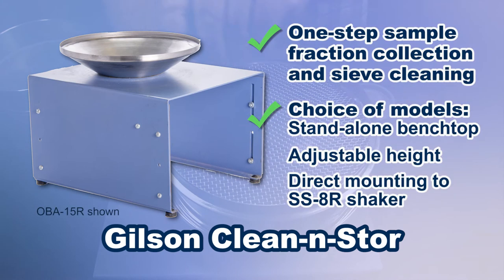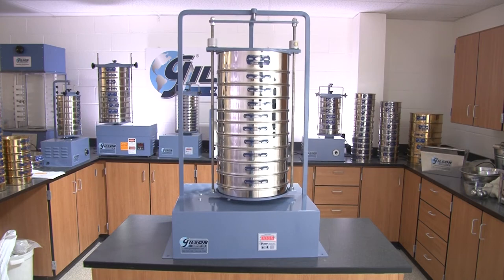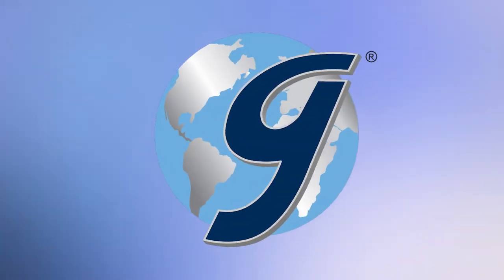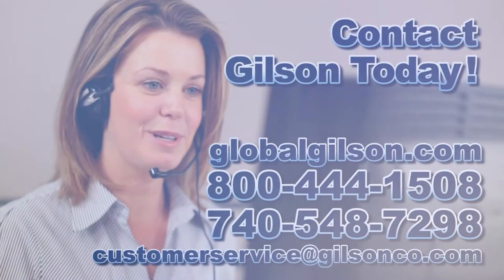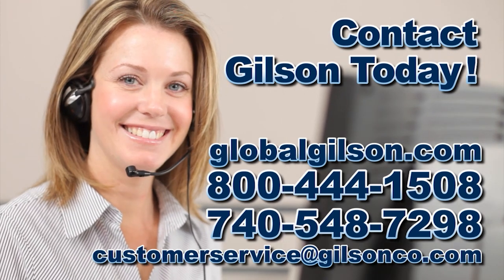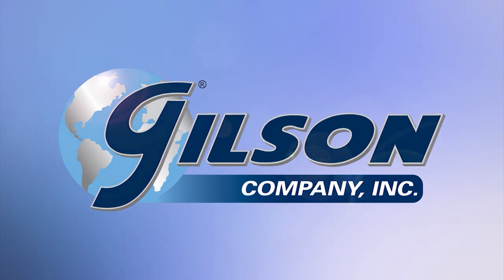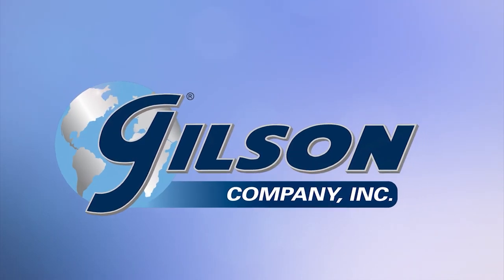Gilson's clean and store are benchtop or standalone devices designed to save time during sieving operations, making Gilson sieve accessories the right choice for your materials testing lab. Be sure to check out these and all our products listed in the Gilson catalog and on the Gilson website. Gilson — your industry leader for materials testing equipment.